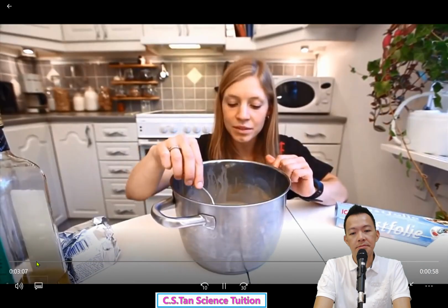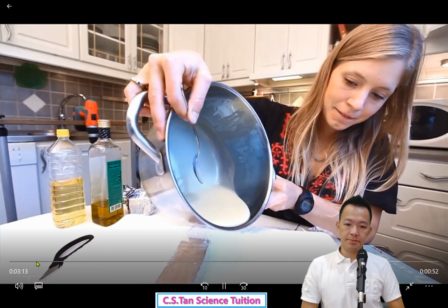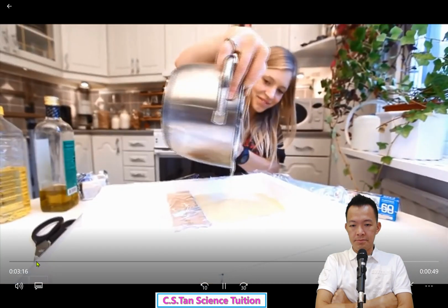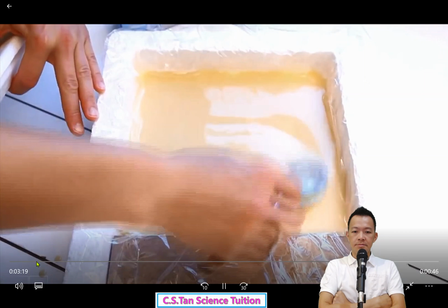After about 1 hour of stirring, your mixture should be ready. And all we have to do now is to pour it in the mold. Spread it out evenly and don't make it too thick because it will expand a bit when it dries. And now we'll just leave it like this for 2 days.